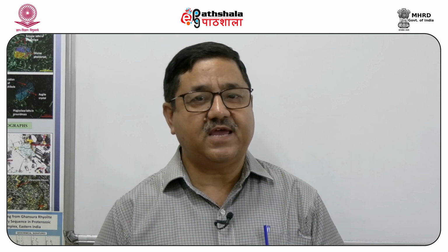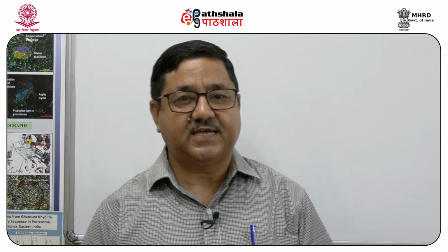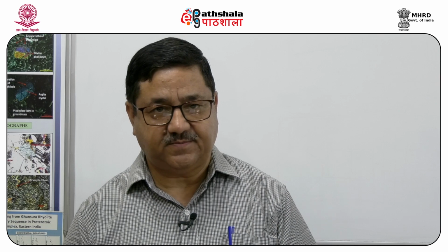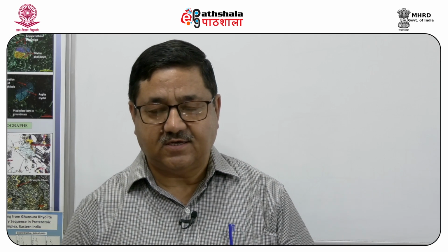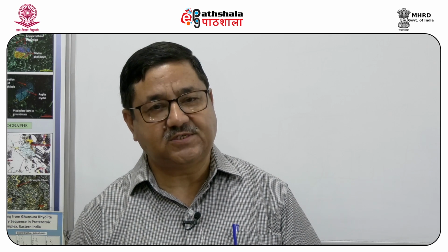The electrons behave in a dual nature, and as we will see subsequently, their wavelengths vary, but can be as low as few picometers. The scanning electron microscope therefore allows us to resolve the heterogeneities of geological material on a very small scale.